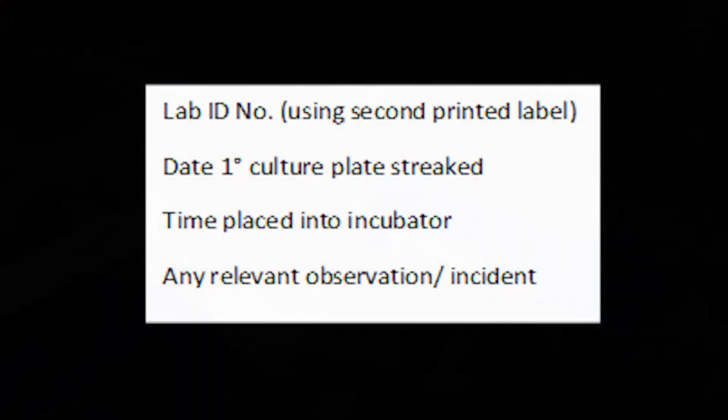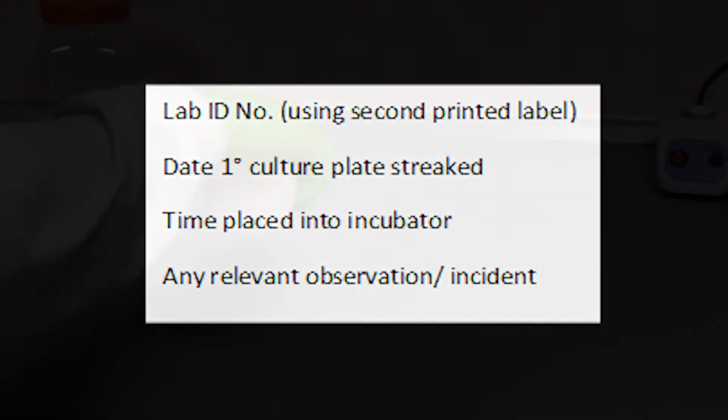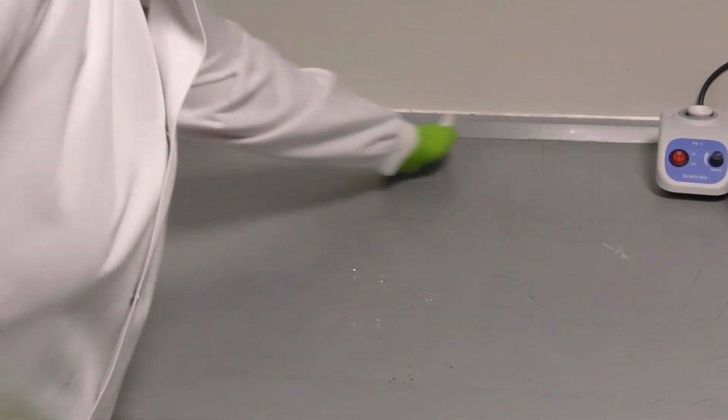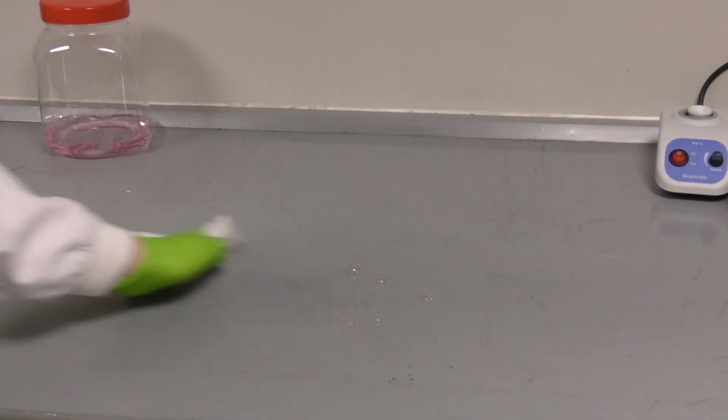Once you've done plating, record all the necessary information in the lab book, including the lab ID numbers for all specimens done, using a second printed label if you've got one, the date the primary culture plate was streaked, the time it was placed into the incubator, and any relevant observations or incidents. You will then need to clean down your bench space appropriately.